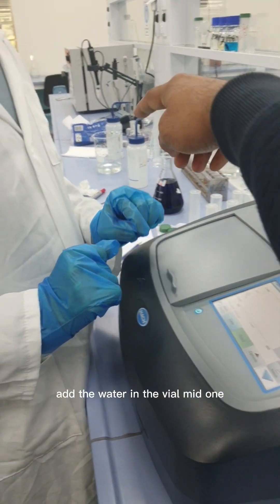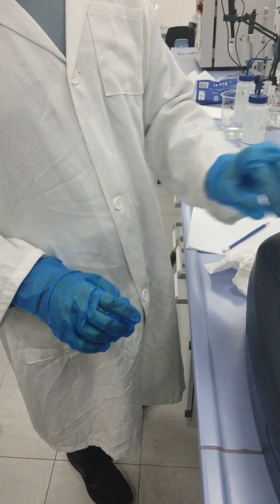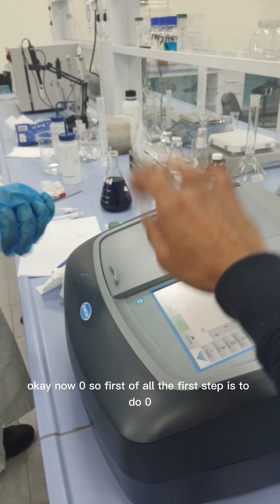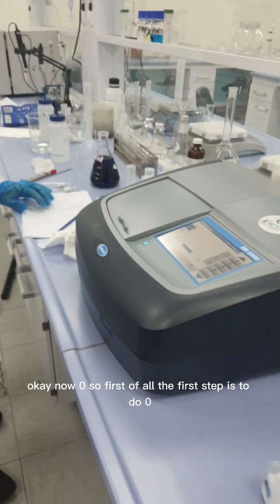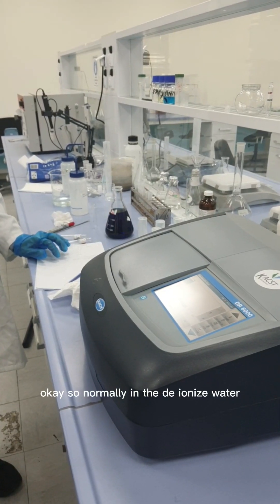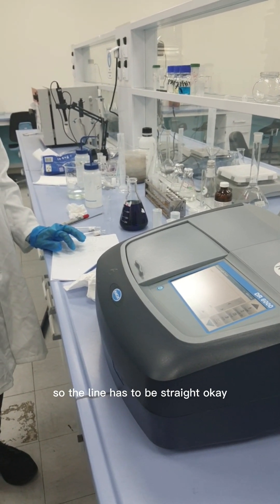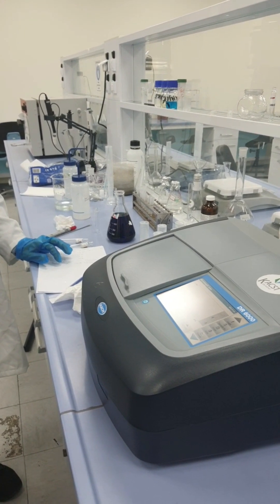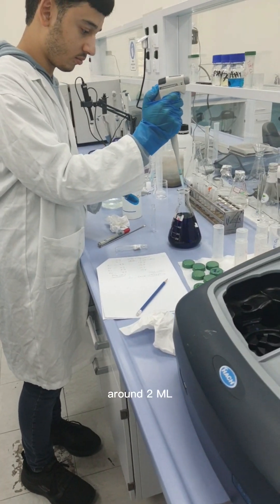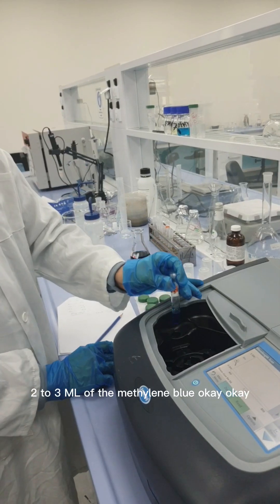Now add deionized water into the cuvette and close it. The first step is to zero the instrument. Normally with deionized water there is no compound present, so the baseline has to be a straight line. Add around two to three mL of deionized water for the blank.